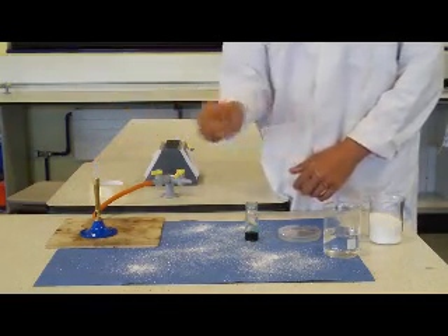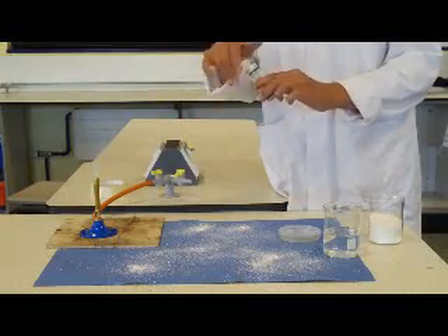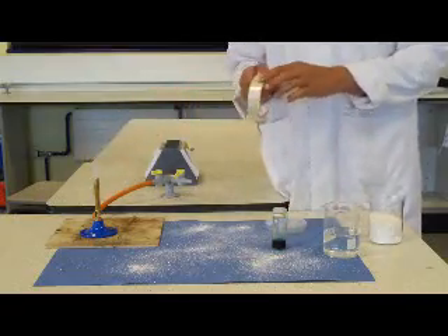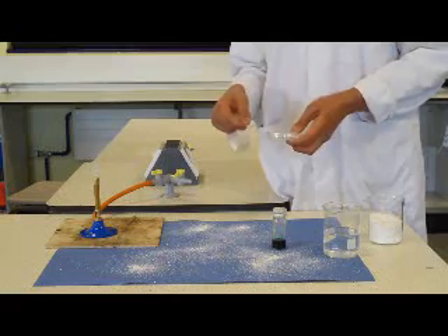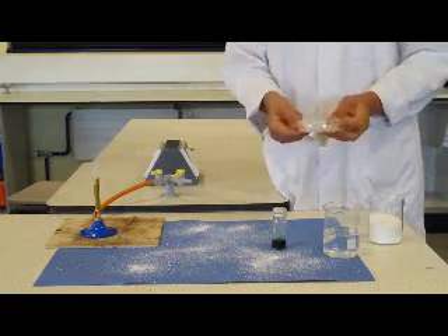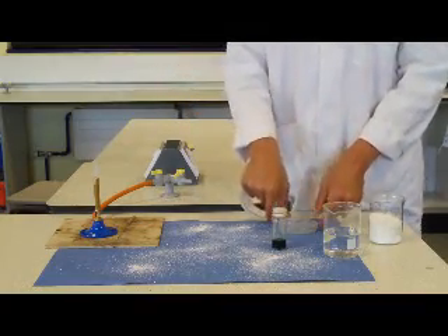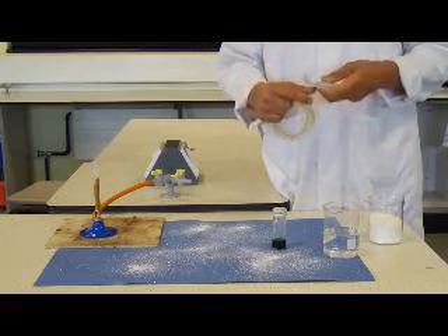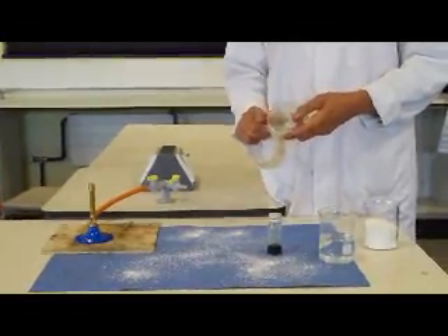The loop cools, and the lid goes back on. A common mistake made by many students is that when they come to sealing their agar dish, they try to make it completely airtight by sealing it around the side. This creates anaerobic conditions and will encourage the development of some really quite unpleasant bacteria. So a simple loop around the lid and dish is all that's required.